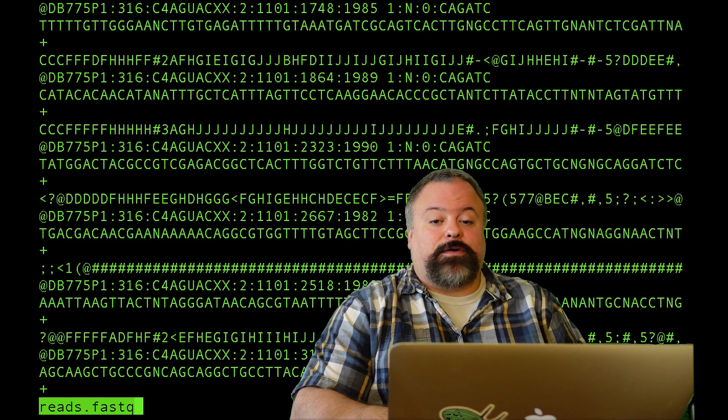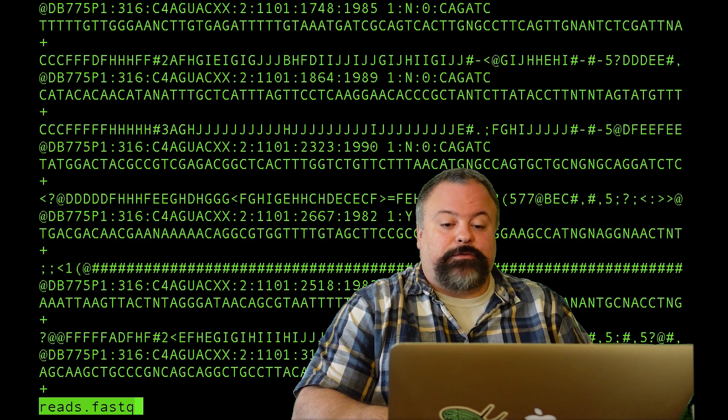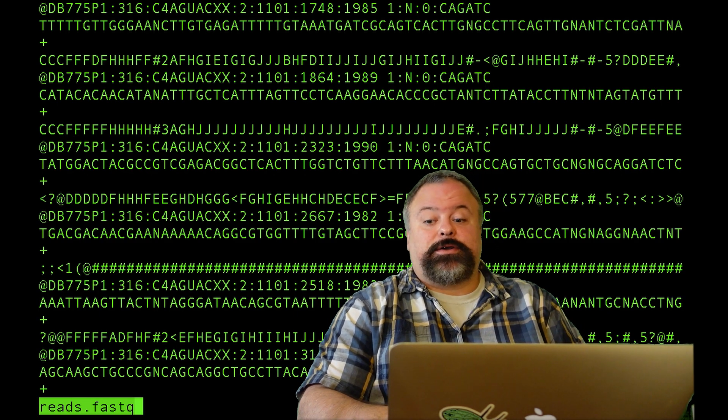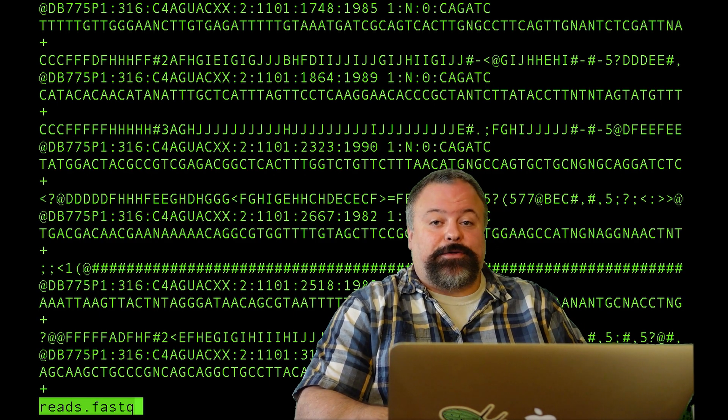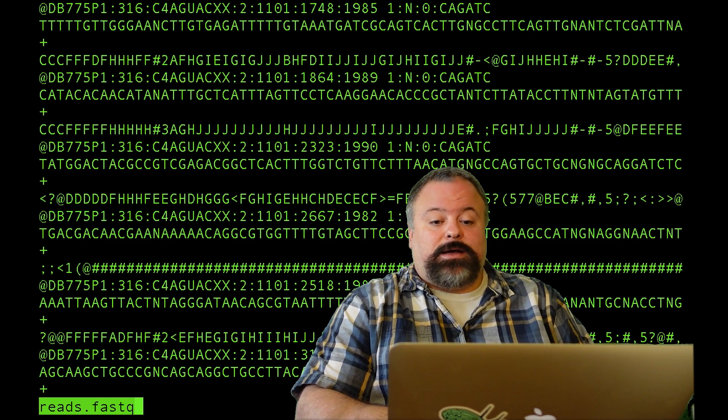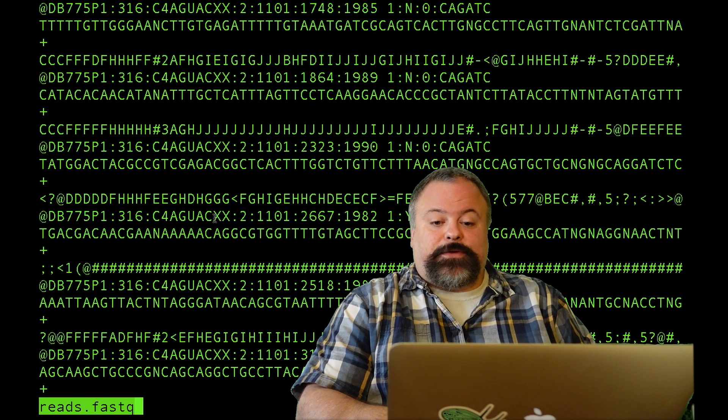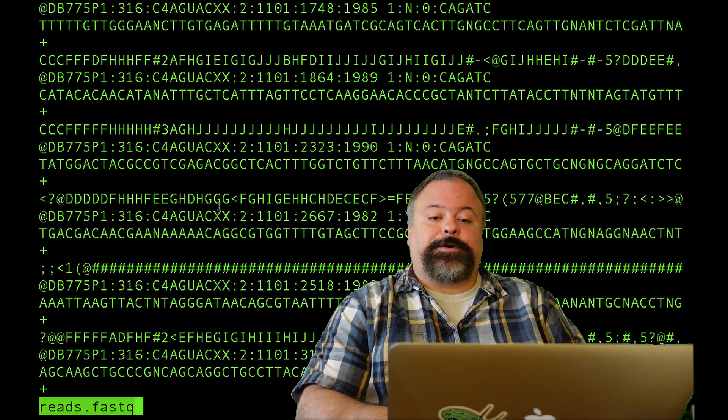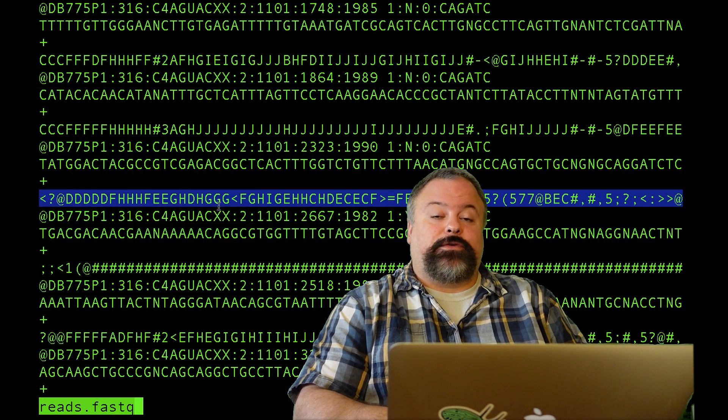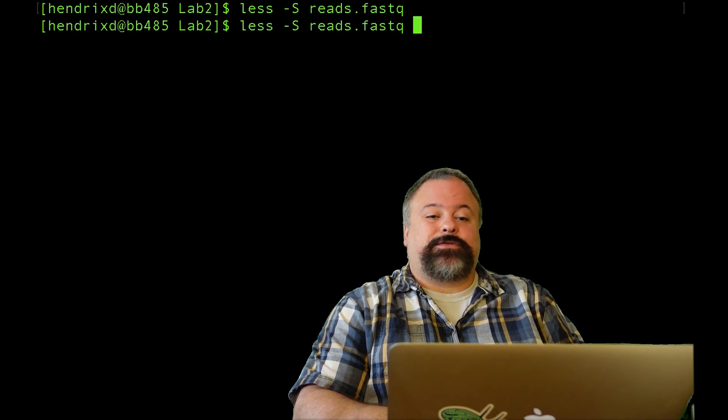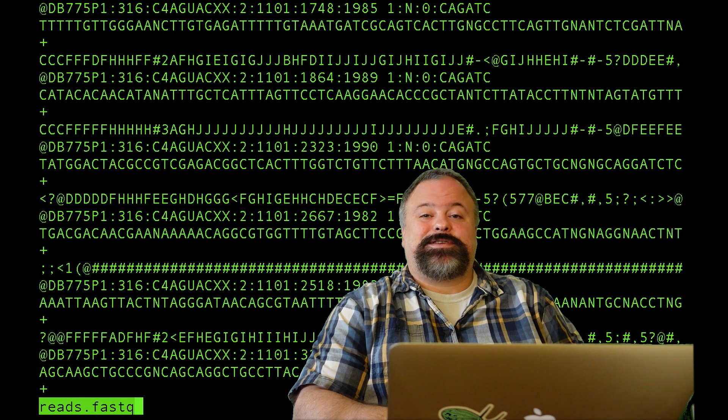I have a FastQ file right here in front of me. If you saw my last video on FastQ files and how they're defined, you would see that this is a FastQ file. And if you haven't seen that video, check it out. But basically, this is a FastQ file.